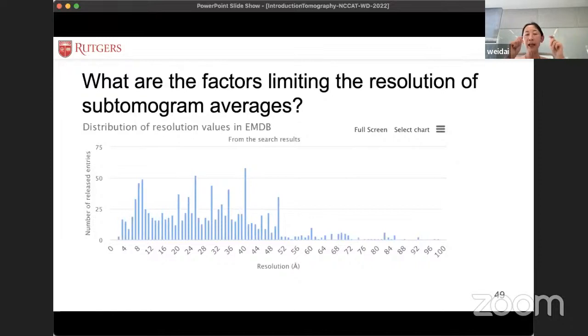And then they can potentially treat each image in the tilt series as an image in a single particle approach. You process individual images instead of processing the whole 3D map. By doing that, you eliminate errors from alignment and you can more easily correct CTF.